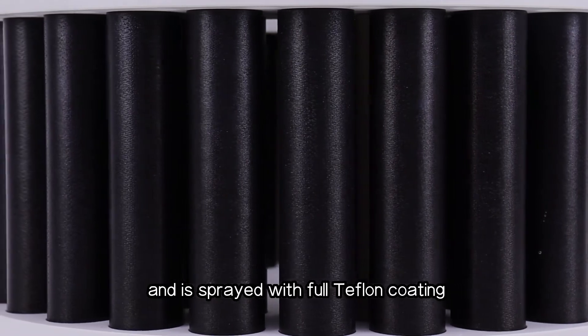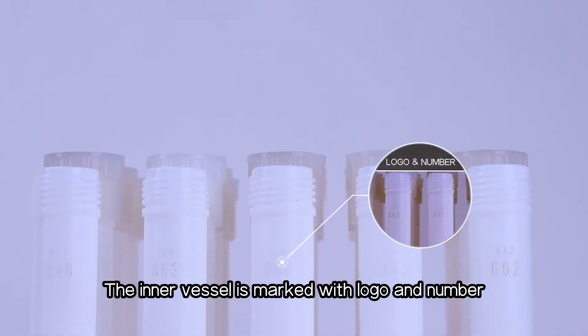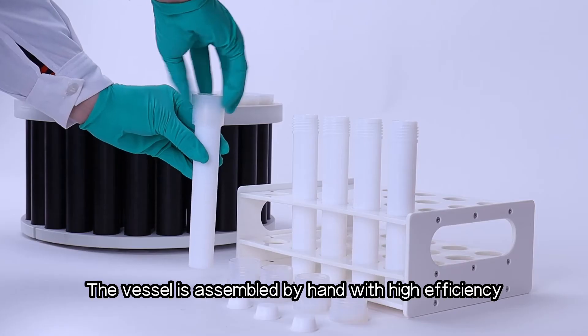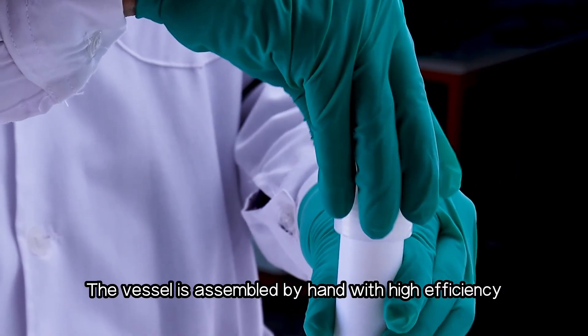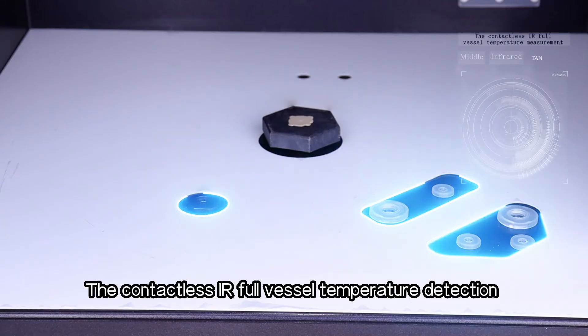The outer vessel is made of aerospace composite fiber and is sprayed with full Teflon coating — it is invincible and easy to clean. The inner vessel is marked with a logo and number for easy recording, and the vessel is assembled by hand with high efficiency.